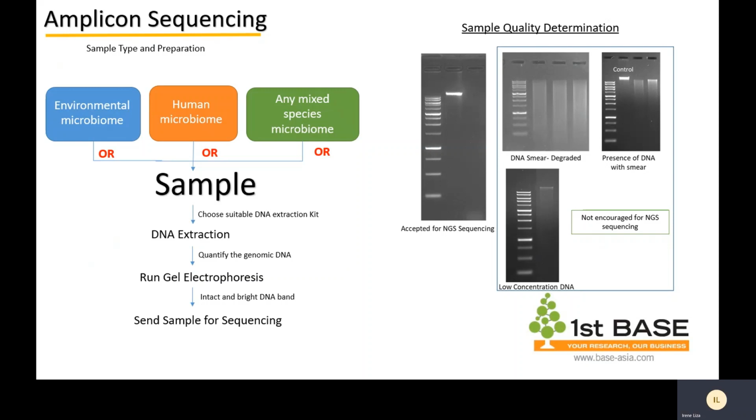Now for this particular amplicon sequencing, because the library preparation is made by amplifying through PCR, the success rate is very dependent. On the amplicon library preparation, when you give us a DNA template like this, the success rate is usually from 60 to 80%. So it depends very much on the amplicon DNA library preparation. All right, so we do not reject, but perhaps the risk is something you have to acknowledge on that part.